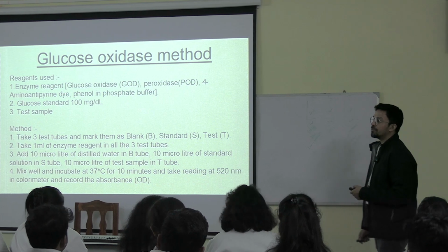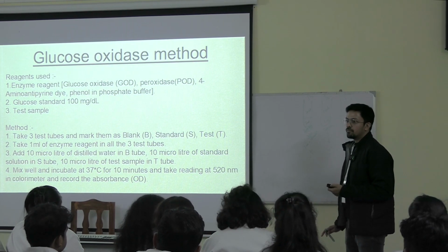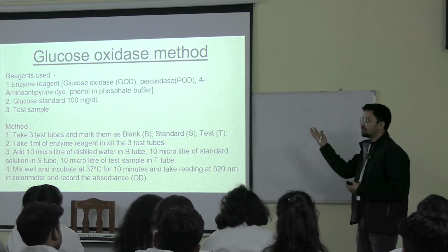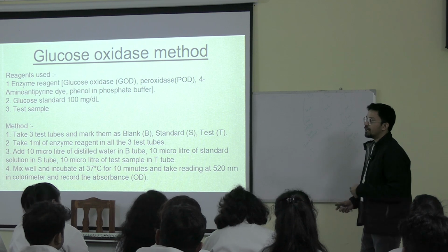Now 520 nanometers is the lambda max. You know the concept of lambda max? Beer-Lambert's law? The wavelength at which the absorbance is the maximum, right? So that is the lambda max. Lambda max is given at 520 nanometer.